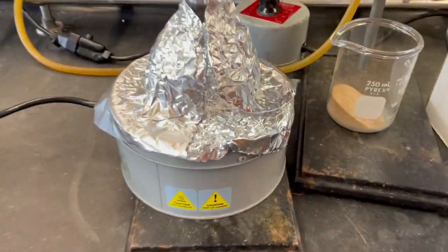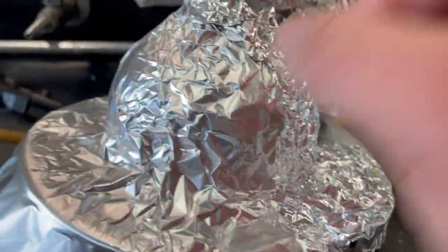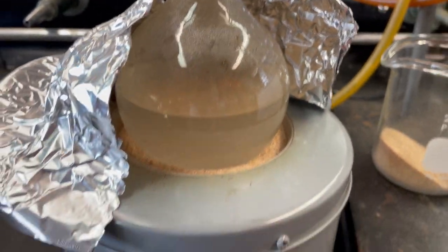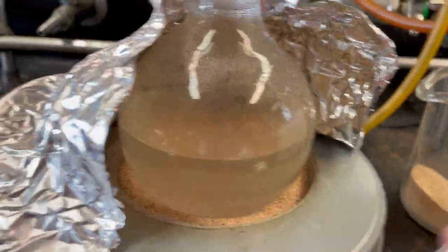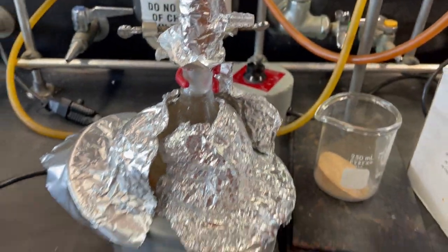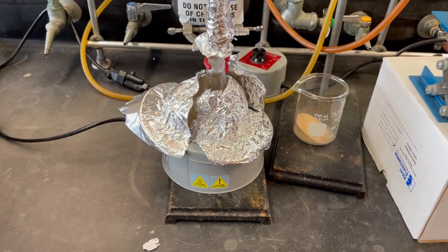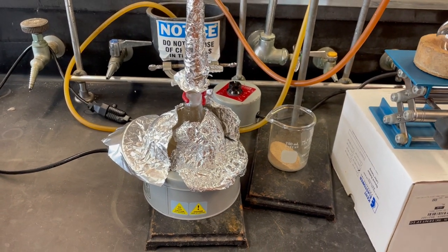Okay, so it's been some time, whatever amount of time, doesn't really matter, but still not boiling. So I can still touch it, which makes sense. I mean, only part of it's in that. I just couldn't get more of it inside of that sand. So we shall wait. Once it gets popping though, it goes fast. So we have to be careful, not get lazy. Make sure we're checking it regularly.